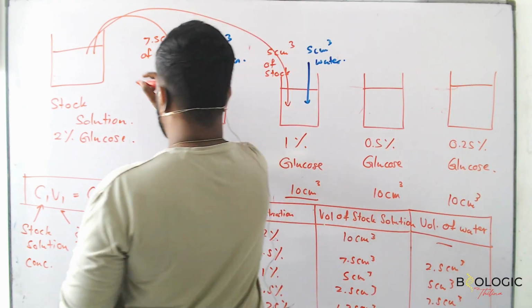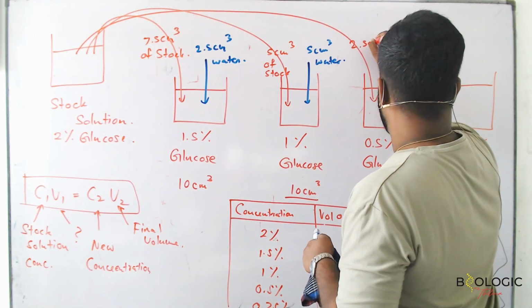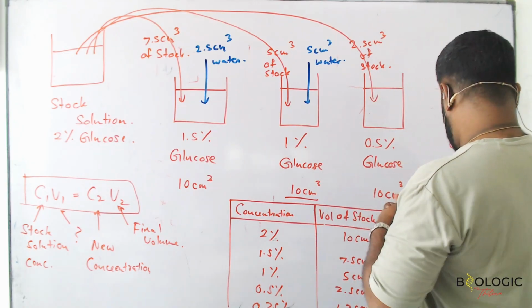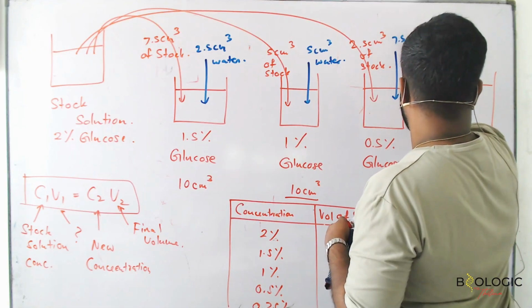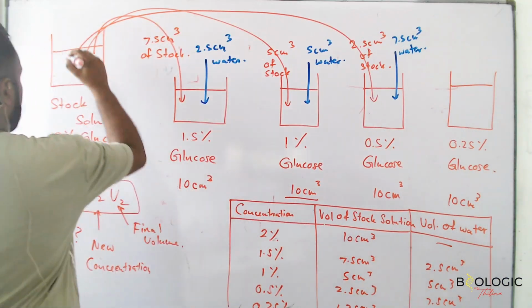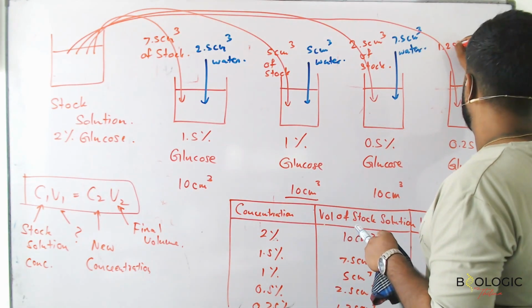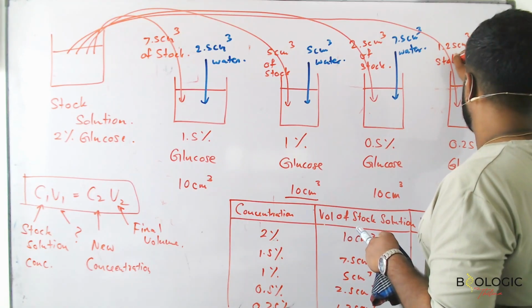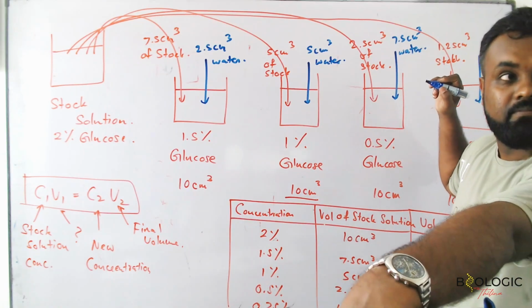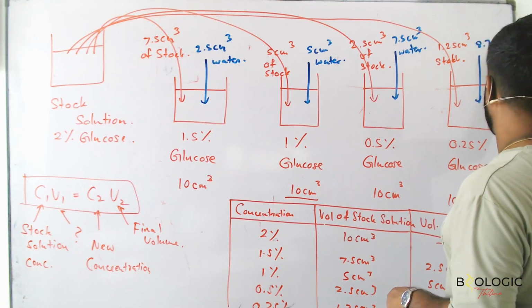Right? Again for this one, 2.5, 7.5 water. And for the last one, 8.75 water.